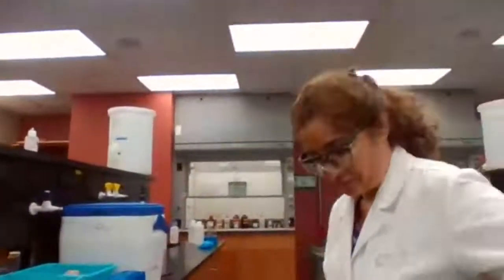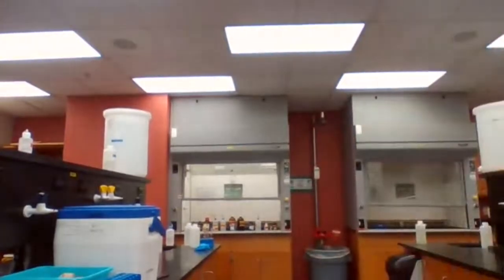Sure. For the data table, you're using the benzoic acid, yes. So the result of benzoic acid, you would use that for your data table, so we know which experiment we've done in the lab. Okay. Any other questions about the carboxylic acid experiment? No?